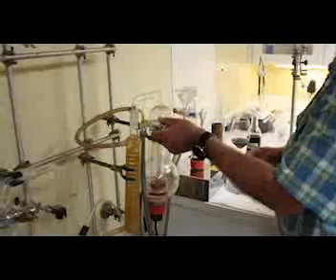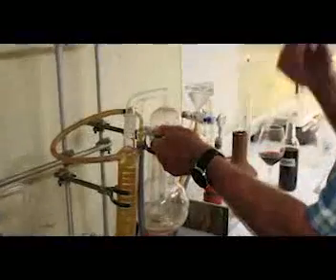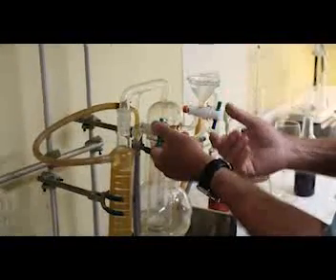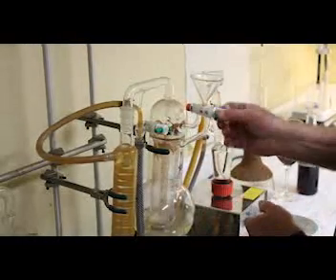And then what I'm doing now is I'm setting up the cash still for the next run. So I've just opened the petcock that pulls all of the sample out, and then I'm filling the bowl that the sample went into with distilled water and letting that pull out.